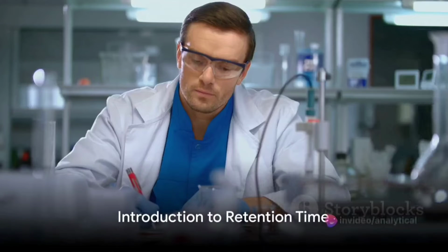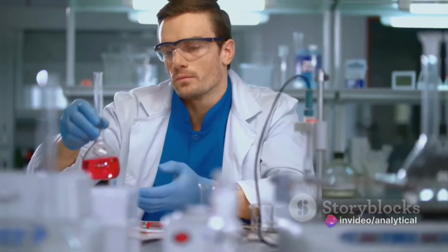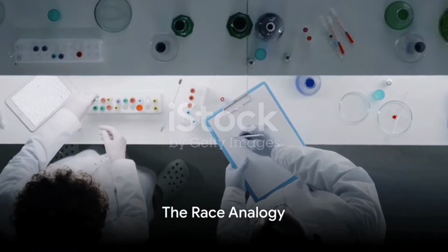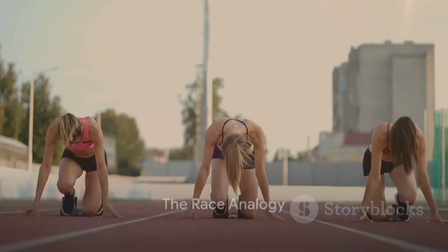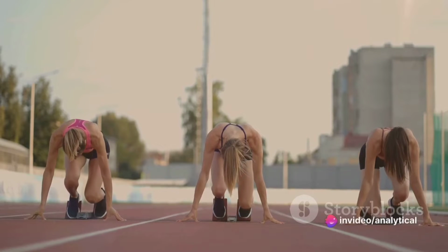Have you ever wondered how scientists identify different compounds in a mixture? The answer lies in a concept known as retention time. Picture yourself in a race. You and your competitors each have different abilities, so naturally, some of you will finish the race faster than others.